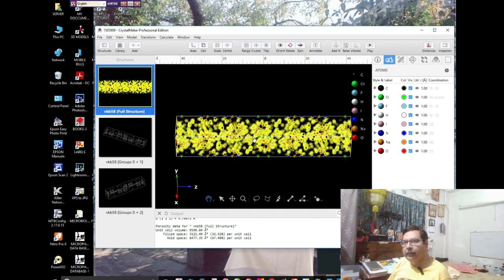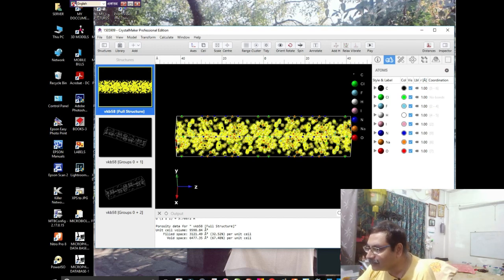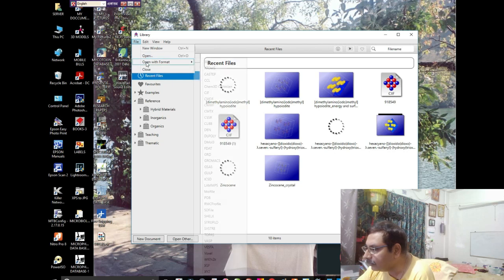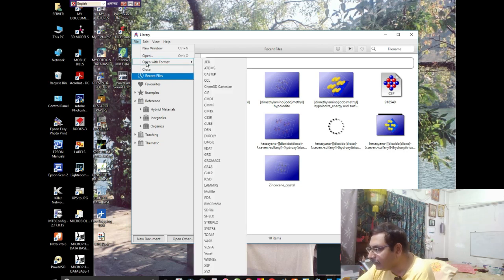Now we are moving to the next part of this video, that is the actual work of Crystal Maker, converting a normal structure into a crystalline structure. Then you observe the beauty of Crystal Maker. So first let us close the file, and we are going to open one. You have to open the mole file.